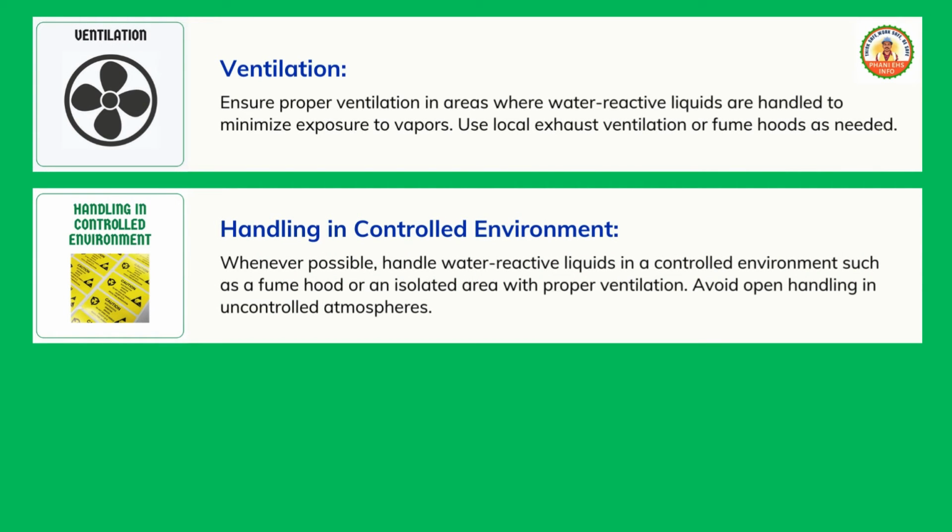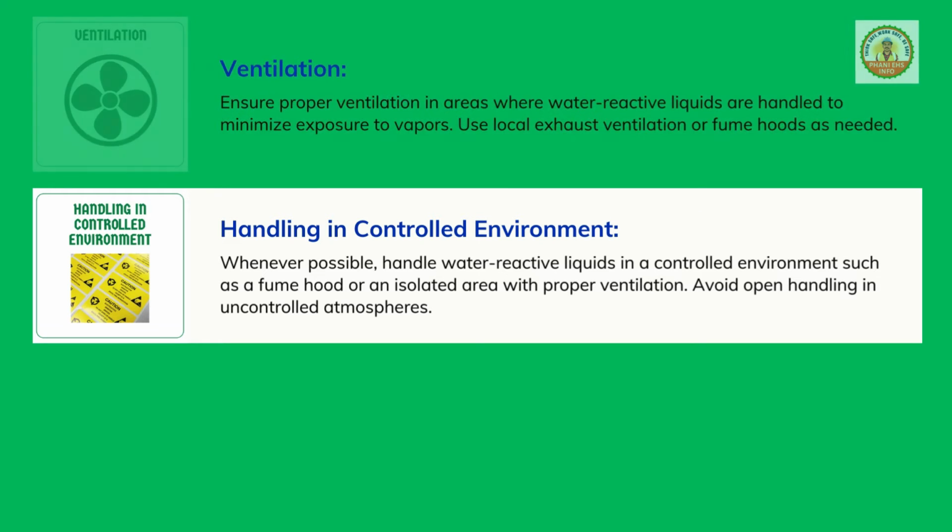Handling in controlled environment. Whenever possible, handle water-reactive liquids in a controlled environment such as a fume hood or an isolated area with proper ventilation. Avoid open handling in uncontrolled atmospheres.